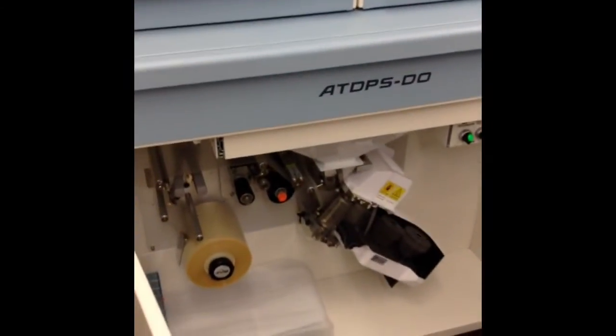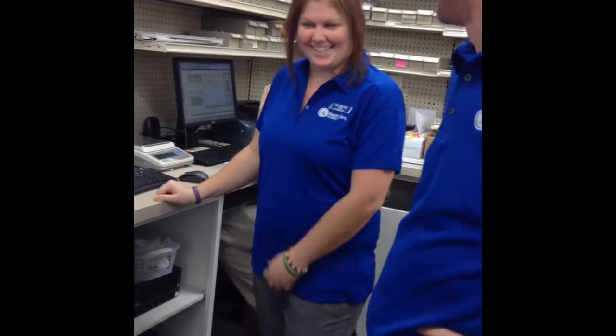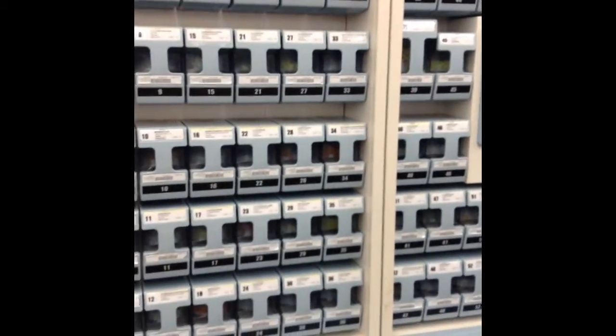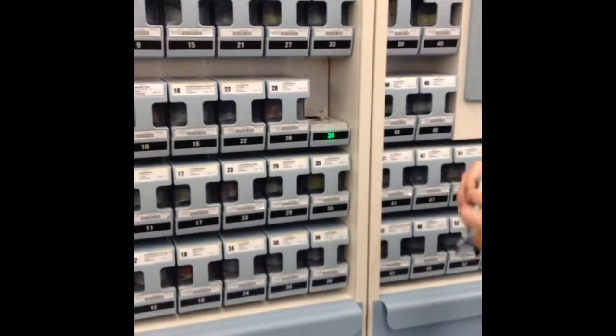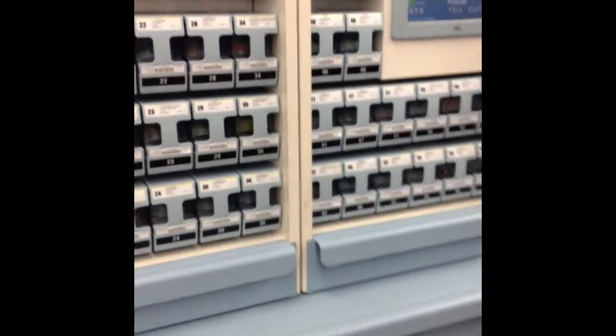We've got Josh and Tracy, and this is the wonderful Rex Packs machine — the pass machine, that's what it's called. So Tracy is going to do samples with Skittles. Each little cell has a barcode, so it's pretty Frank-proof, or dummy-proof if you will. So watch this thing.